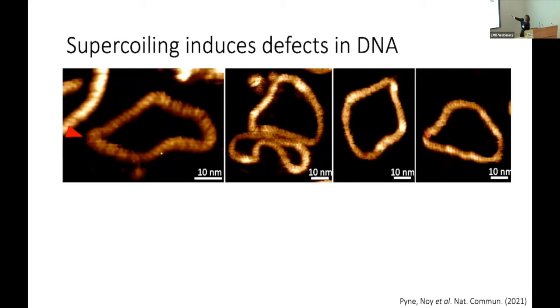They're much lower, they're a darker sepia. And so we move from a high double-stranded region to a low single-stranded region, and then back to a double-stranded region. And so we have these areas of multiple defects that are occurring in DNA that's not been exposed to any enzymes, just as a result of being a little bit or quite underwound, because they're quite short.